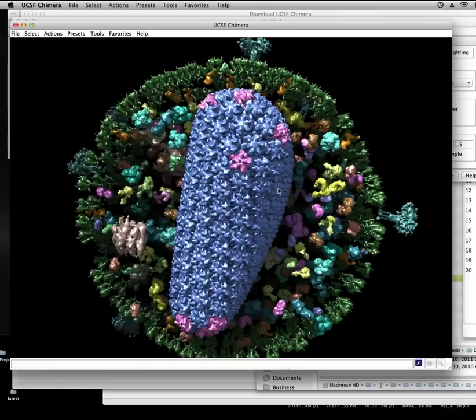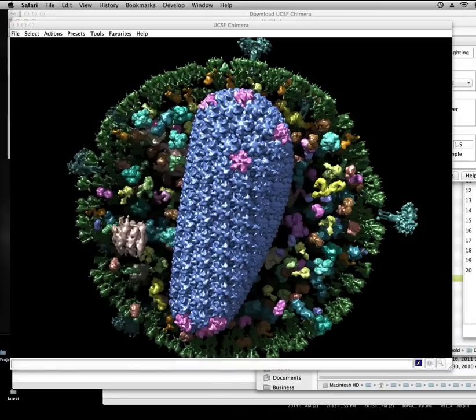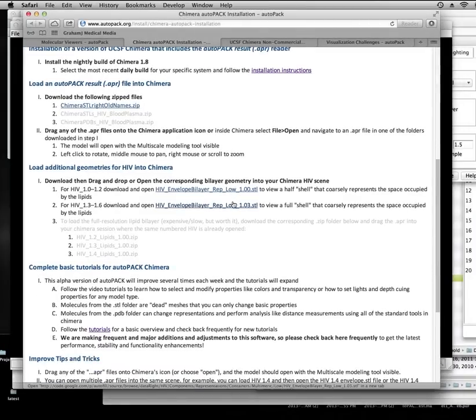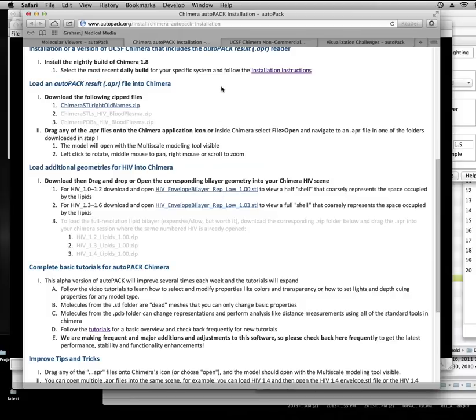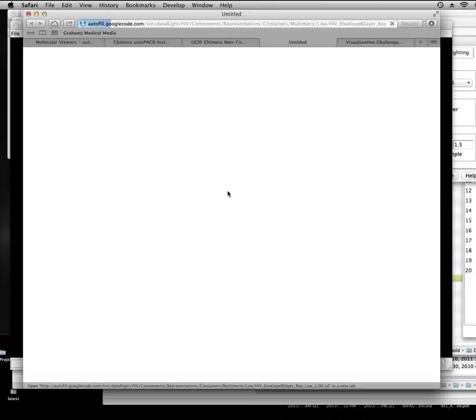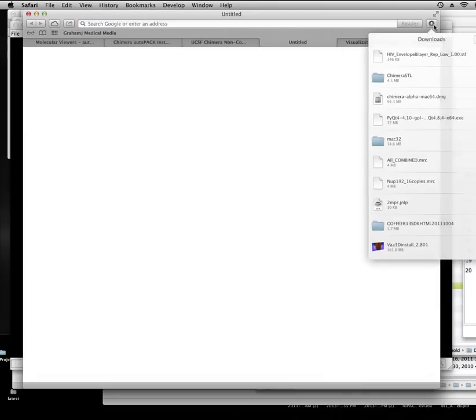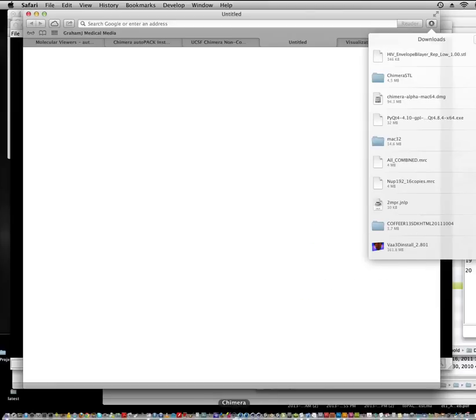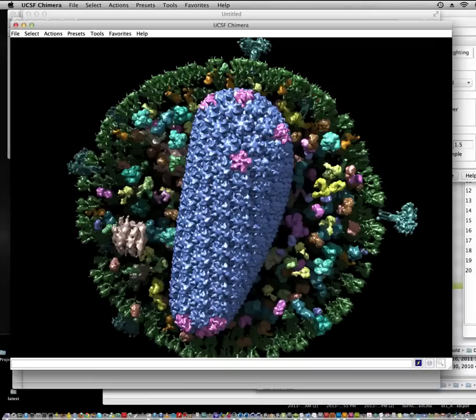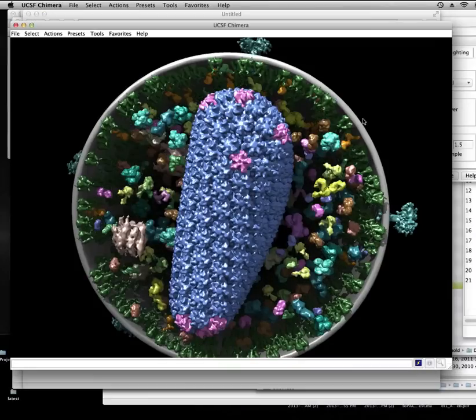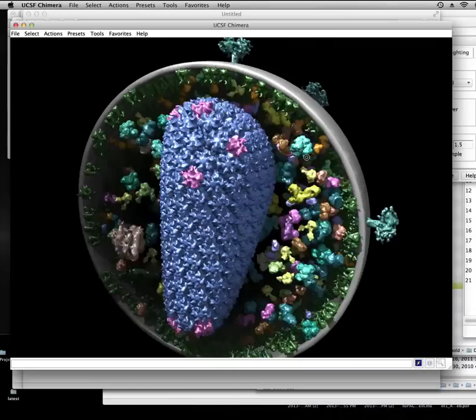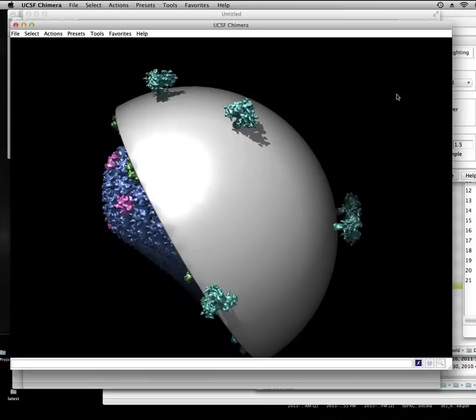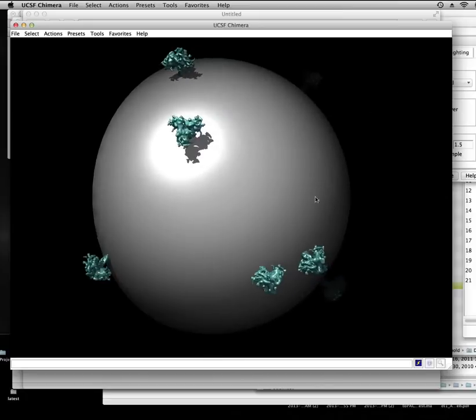And then if we go back to our instructions, it mentions here that you can load additional geometries into the model. And I know that right now I've loaded the HIV 1.0, so I want to grab this lipid shell as well. All I've got to do is drag that right into my camera icon and pop, we see this gray shell onto the outside.